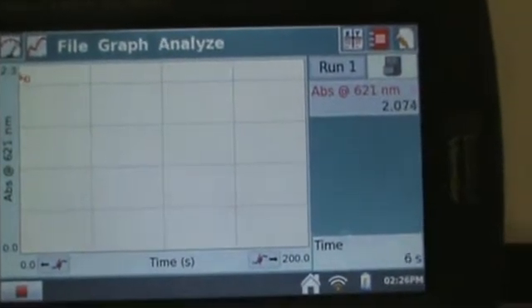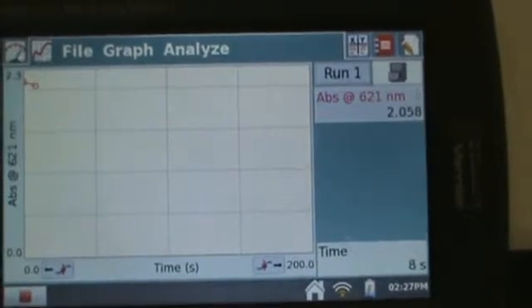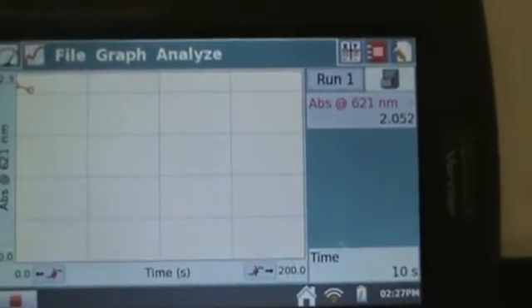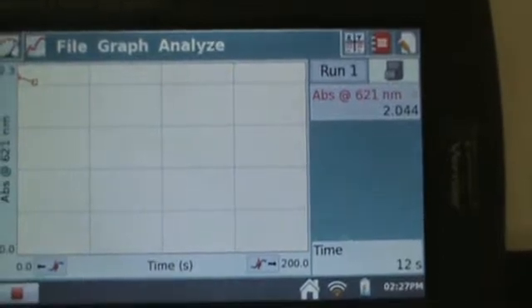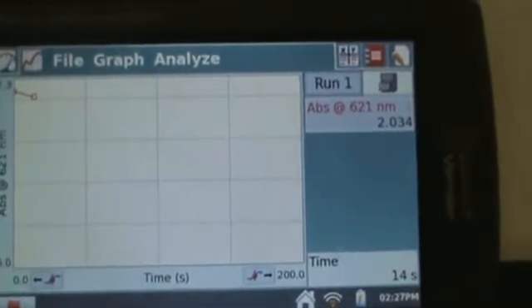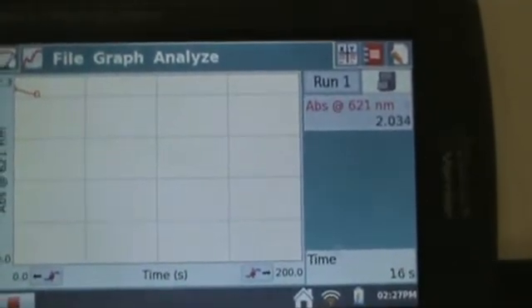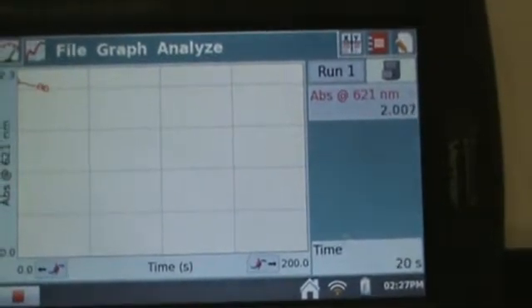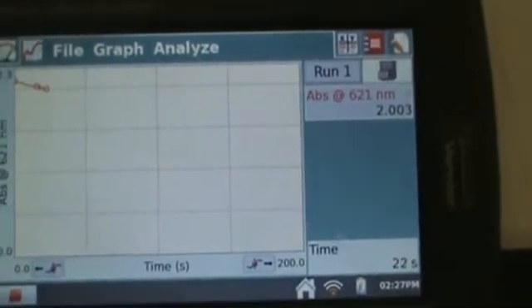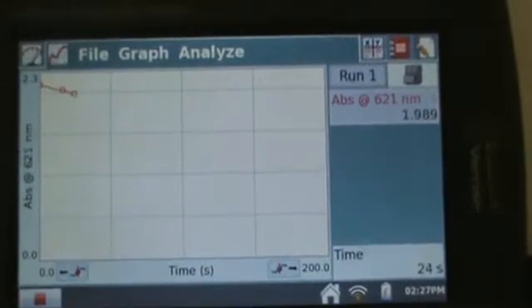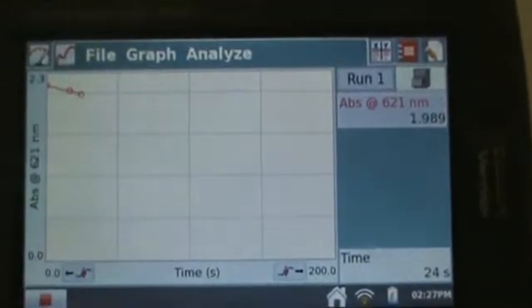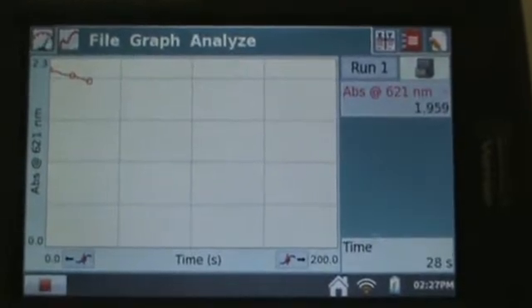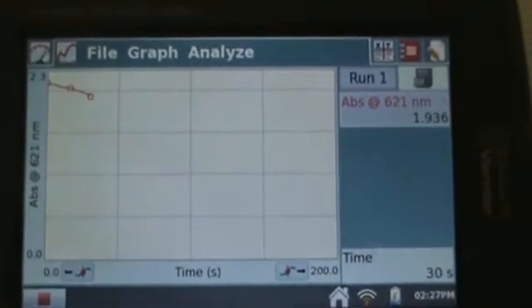Currently we have a very high absorbance — probably a little too high; we don't want to be too much above one. And then as that reaction happens, as the green food dye gets oxidized, we're seeing it start to drop and drop and drop. How it drops gives us information on what type of reaction is going on in terms of the mechanism. The rate of the reaction we can translate into the elementary steps and what the rate-determining step is.